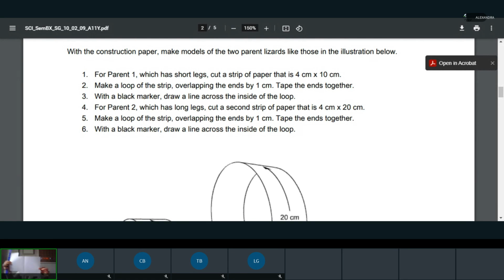So as you can see, I've already cut over here on the paper and over here. What I would recommend is taking the edge of your paper and using your ruler, making sure that you're using the centimeters, or the metric side, right? When you take a look, this is inches on the bottom, centimeters are going to be at the top. So using your ruler with the metric side, I want you to take the edge of your paper.